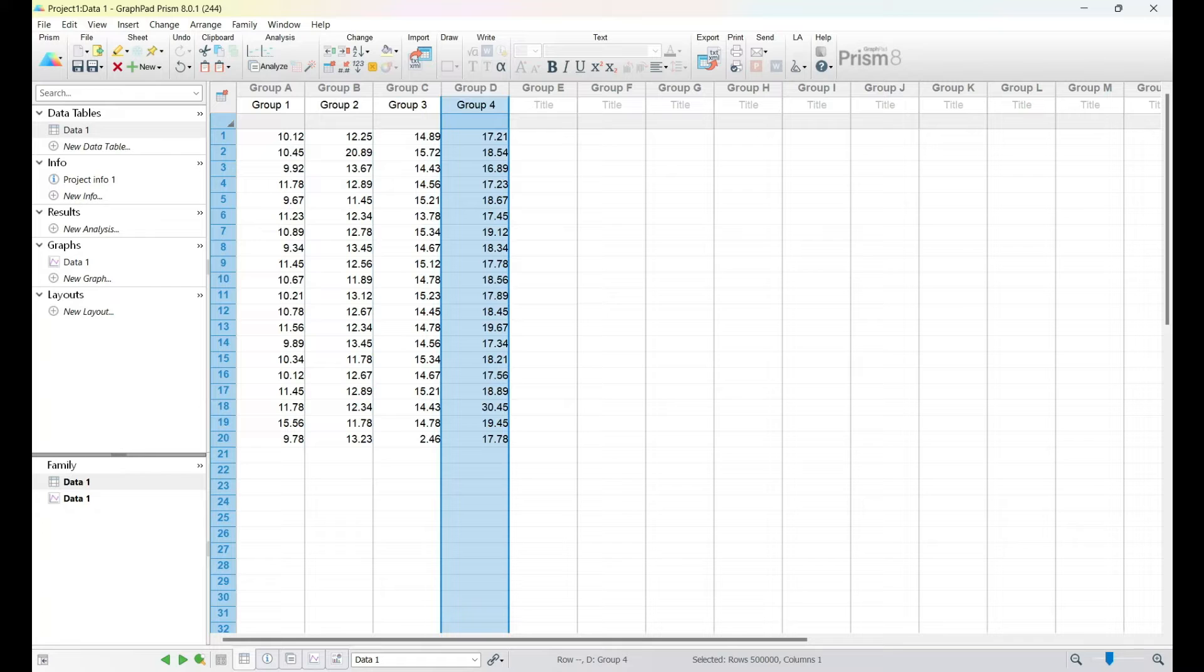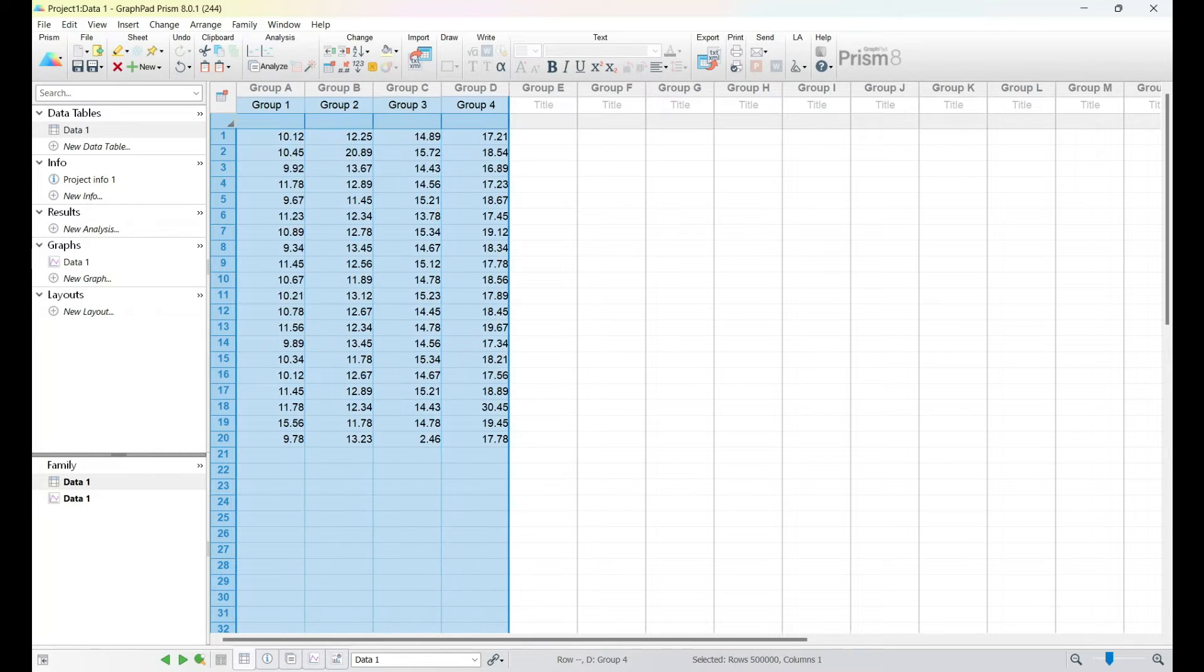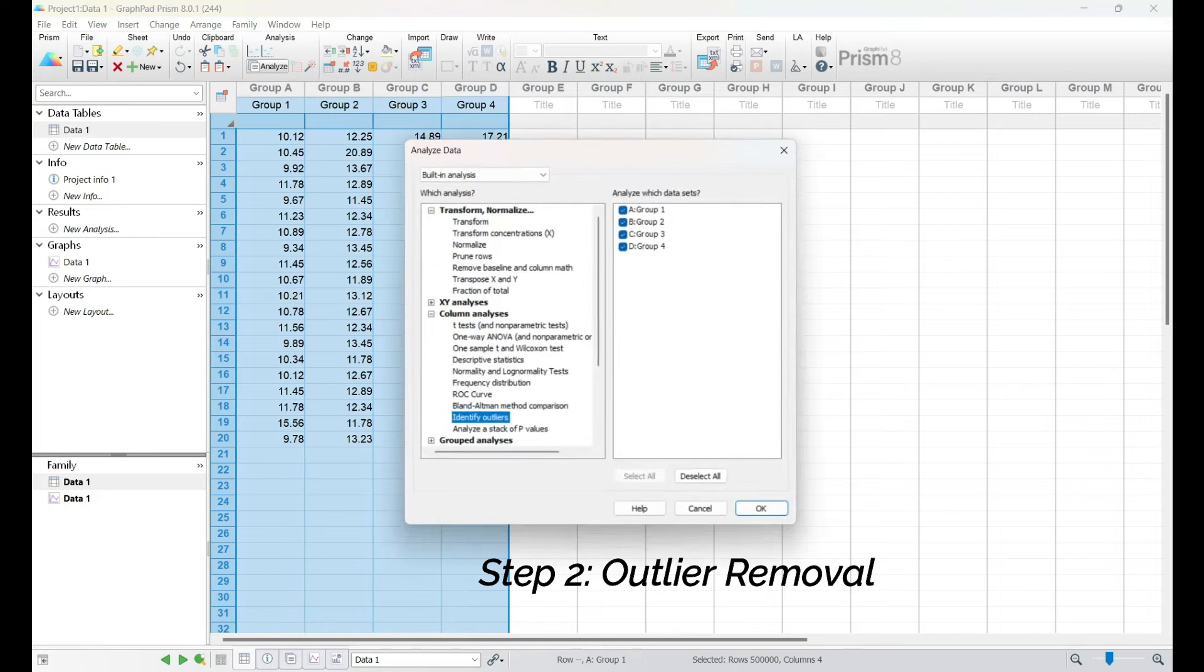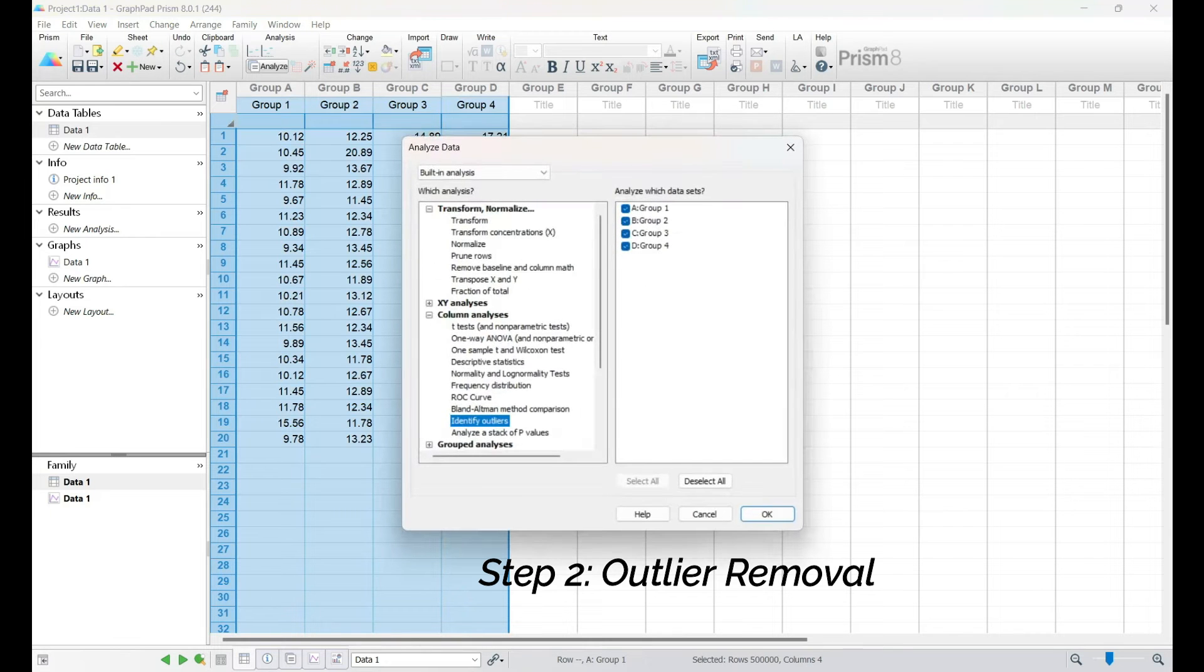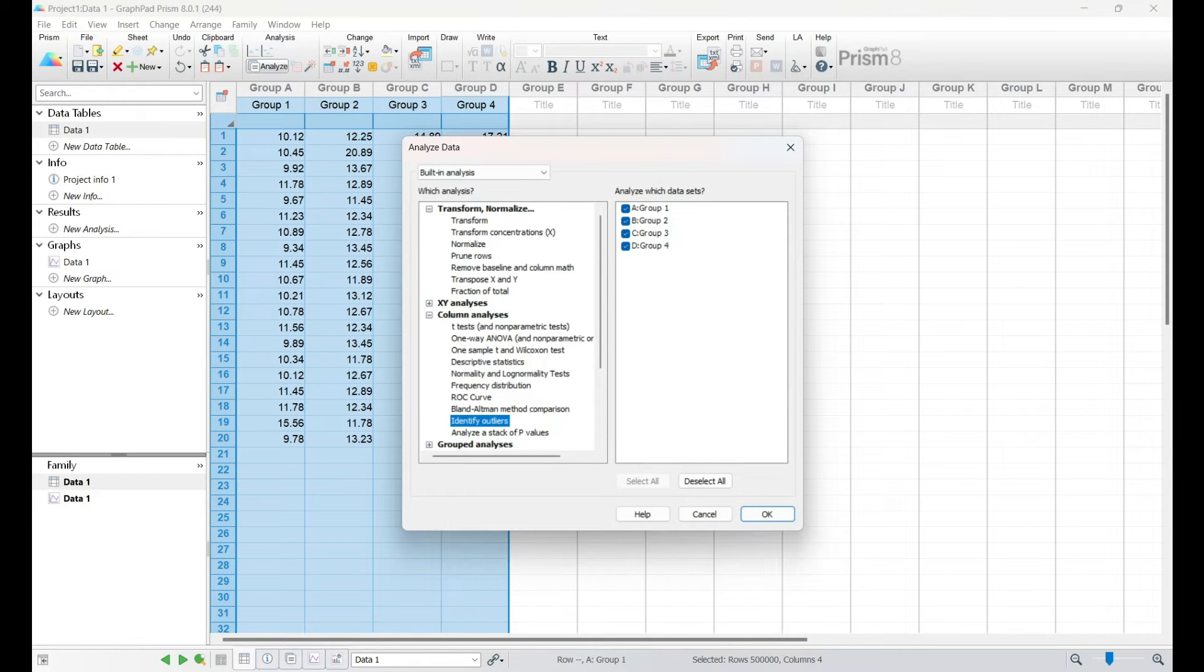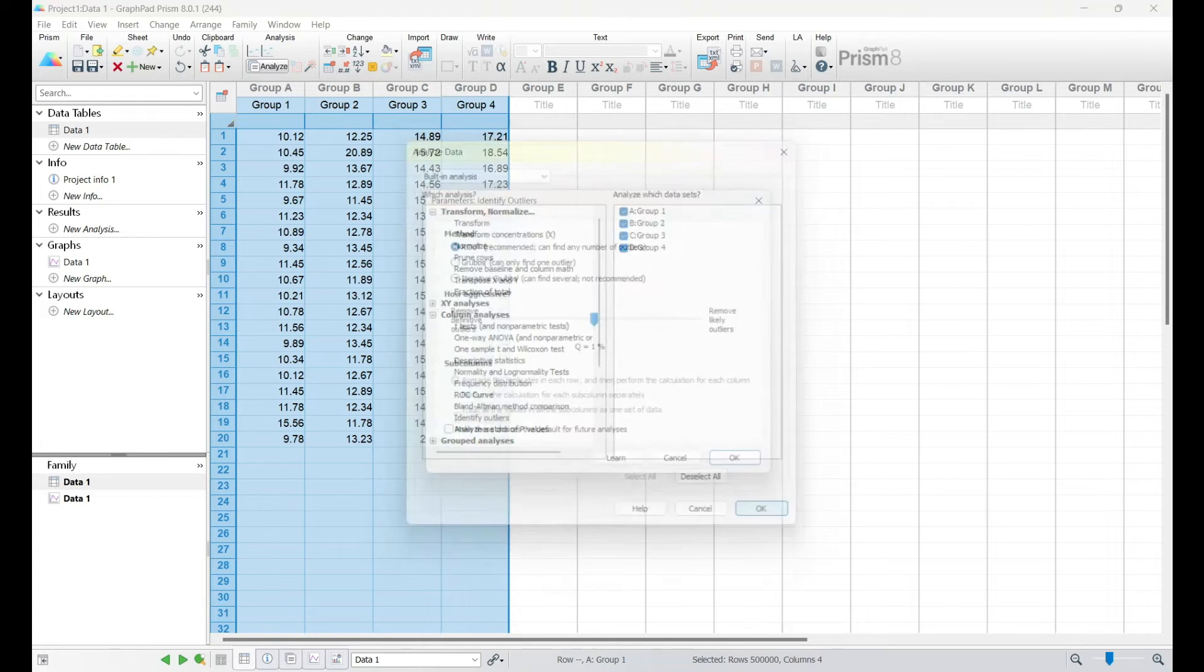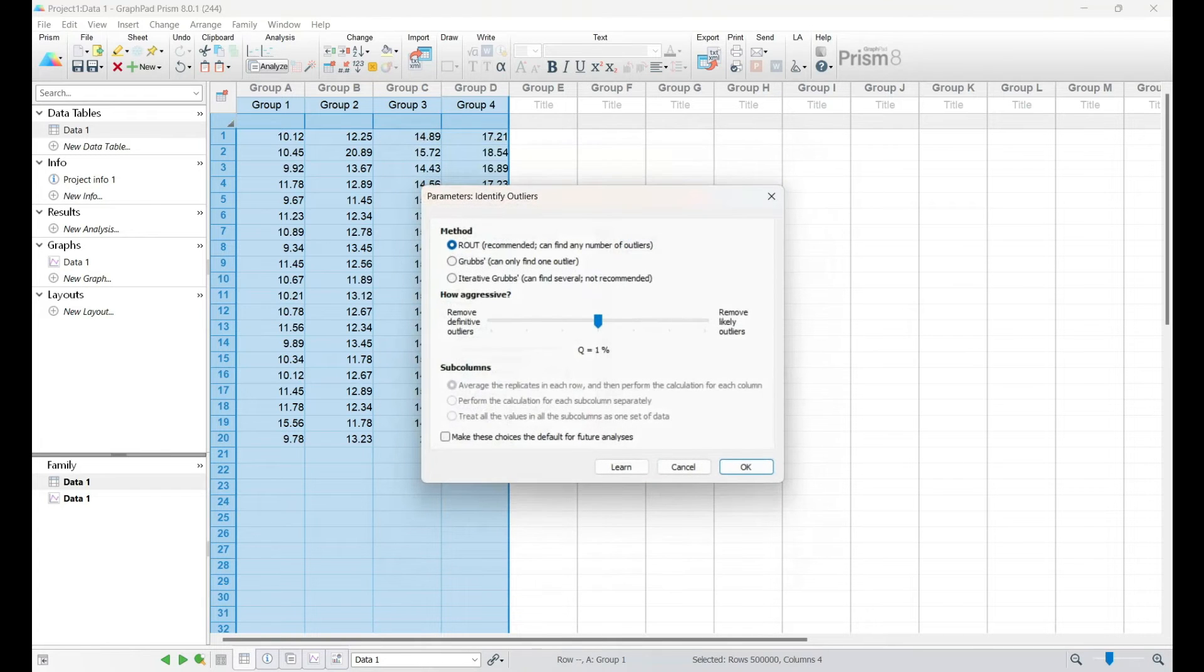With our data set up, the next critical step is checking for outliers. Outliers can significantly impact the results of statistical tests, so it's important to identify and address them appropriately. In GraphPad Prism, head to the Analyzing tab and select Outlier Test.